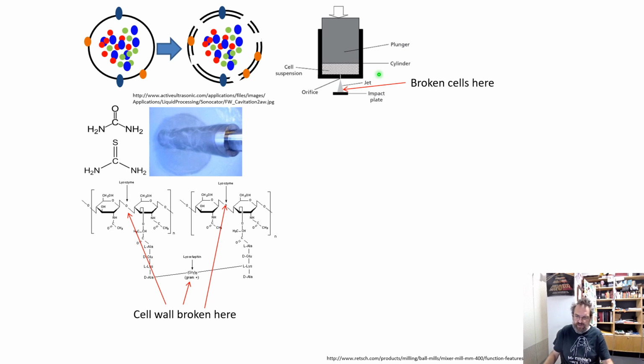The other thing you can do, if you're dealing with bacterial cells, is use things like lysozyme, enzymes that actually break down peptidoglycan and things like that. I'm not a huge fan of these things, and the reason is that I don't necessarily like adding proteins to samples of proteins, because if you add too much of this stuff, all you start to do is measure the presence of those molecules. You're already adding trypsin at low concentrations. You're potentially adding benzonase to shear DNA. So the fewer things you can add, the better.